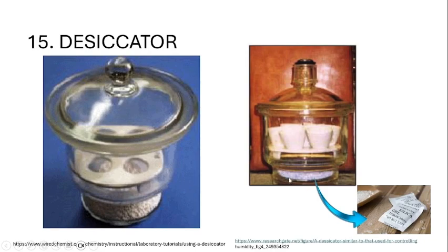These small solids are actually silica gel. Usually it's silica gel, and it is called your desiccant. Silica gel may be familiar if you open your newly bought shoes, for example. So you will find that there. It is used to maintain low humidity within your container. That's why you use the silica gel as your desiccant.